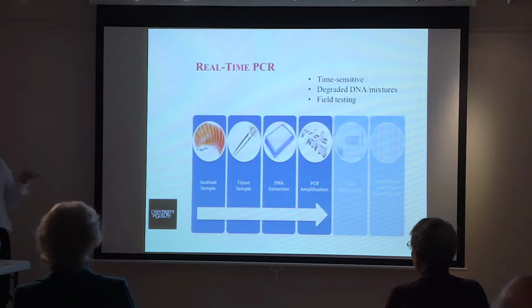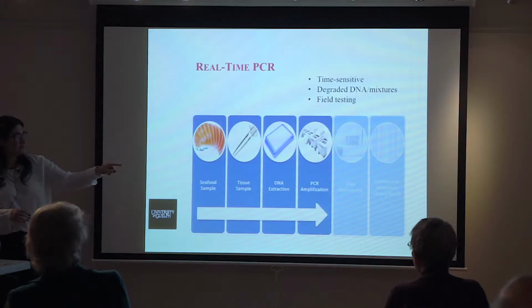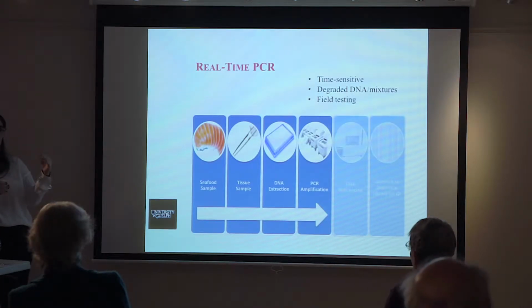And then we can use those species-specific primers and a fluorescent probe in the middle of them to actually monitor that copying of DNA in real time, which means we're cutting down on the steps that are required to get our answer. So instead of having to do the DNA sequencing and compare it to a library, the process actually stops at that PCR amplification stage, and the fluorescence that's generated tells us whether that target is there or not there. So you have this really nice simple output of either there or not, a yes or no answer for your target, and it takes a lot of the time and cost out of processing the sample. So this means that we can make use of the DNA barcode library for cases where an answer needs to come back that's time sensitive.